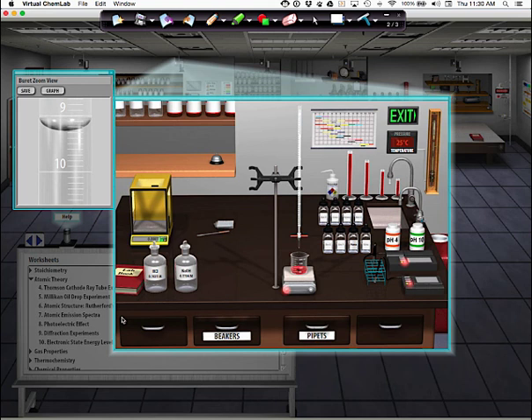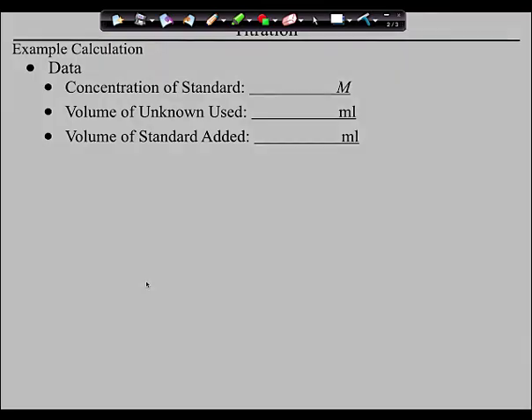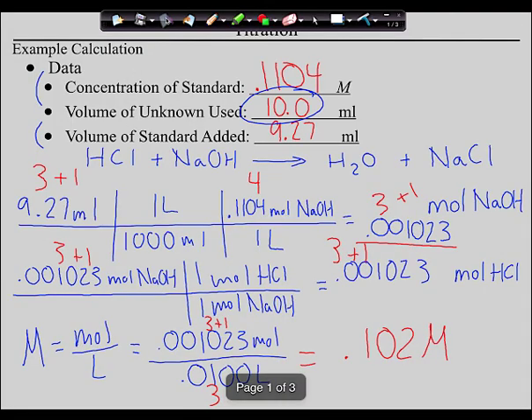Guys, here's the thing that's cool. When you come back and do this with me in AP Lab, we will use all of this glassware. I'm going to teach you some tricks in lab, and we can actually get accurate to 5 decimal places. 100,000 of a molarity. It's amazing how accurate this can be. Even in our labs, we can do this very well. So, guys, there you have it. Any questions about the process? Any questions about the math? Any questions about what you're going to do in lab on Monday? You guys all okay? You're good?